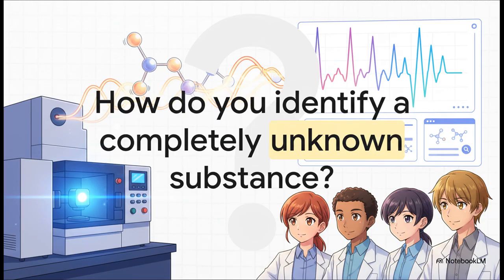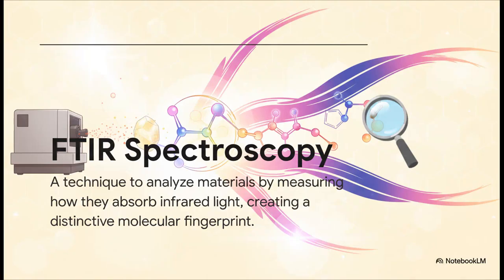So let me set a scene for you. Imagine you're in a lab and someone hands you a vial with a totally unknown clear liquid. How do you figure out what it is? You can't just guess, right? You need a rock-solid method, a way to basically ask the molecules themselves, hey, what are you? And the answer lies in this incredible tool called FTIR spectroscopy.